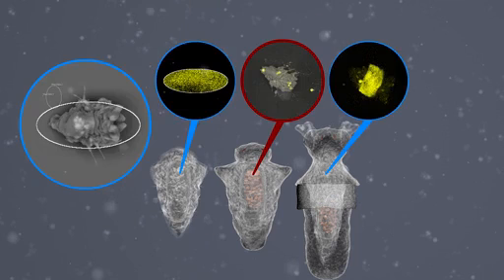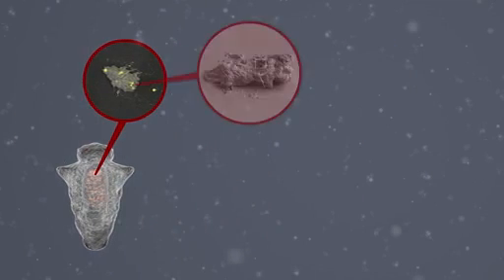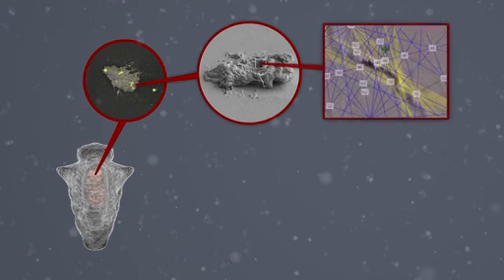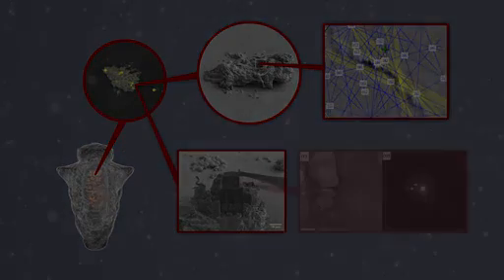A newly mineralizing life stage is identified using SEM-EDS mapping for calcium signal. Then, the regions with a high calcium signal are screened using SEM-EBSD, identifying the presence of crystalline mineral. Finally, using a focused ion beam, the mineral is cut out. A thin section is prepared for TEM.